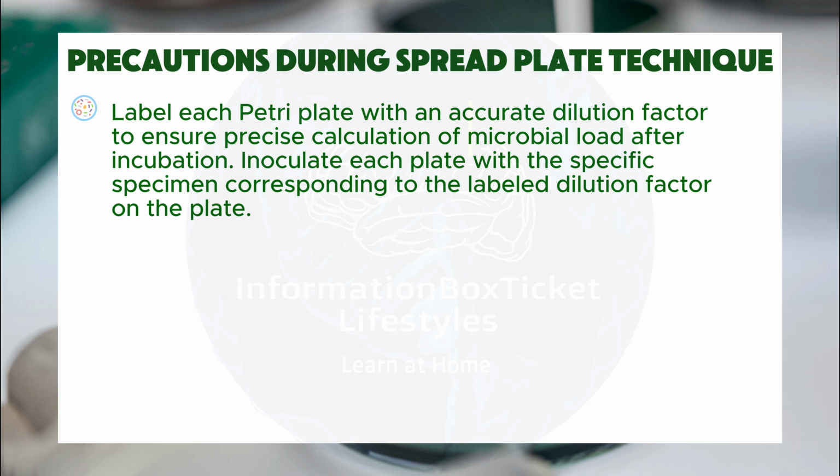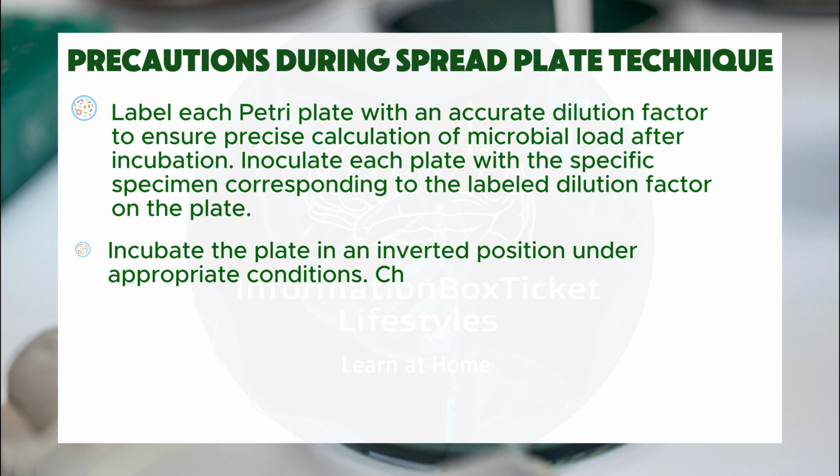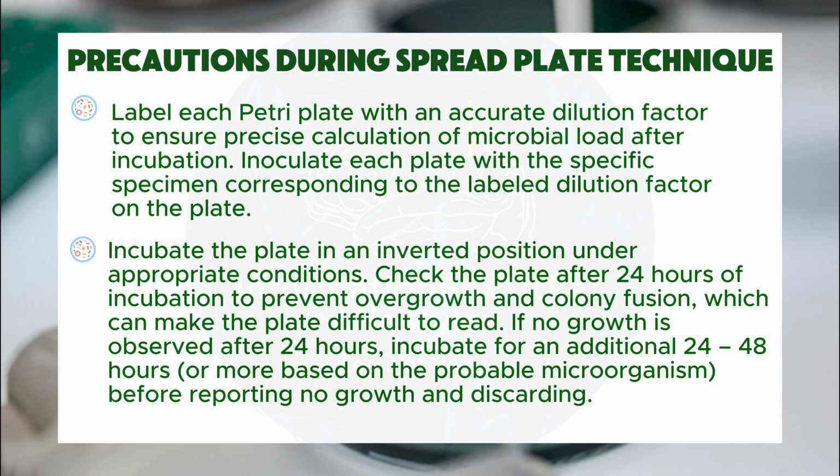Label each Petri plate with an accurate dilution factor to ensure precise calculation of microbial load after incubation. Inoculate each plate with the specific specimen corresponding to the labeled dilution factor on the plate. Incubate the plate in an inverted position under appropriate conditions.